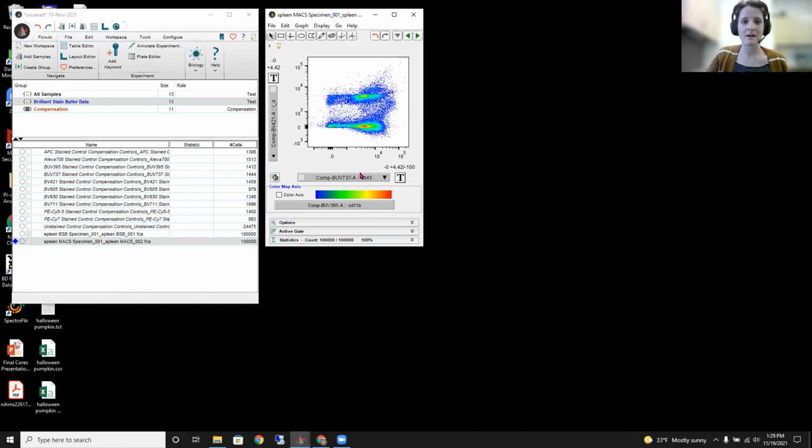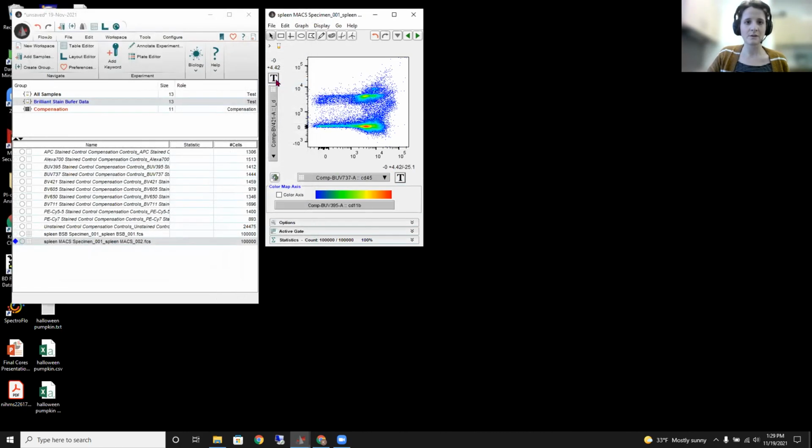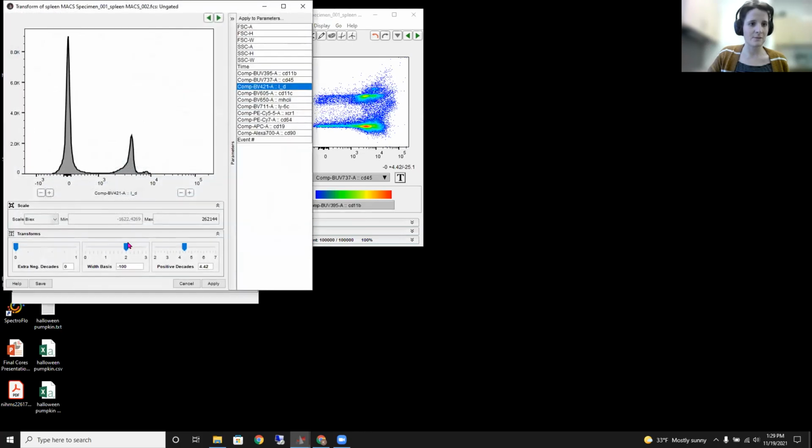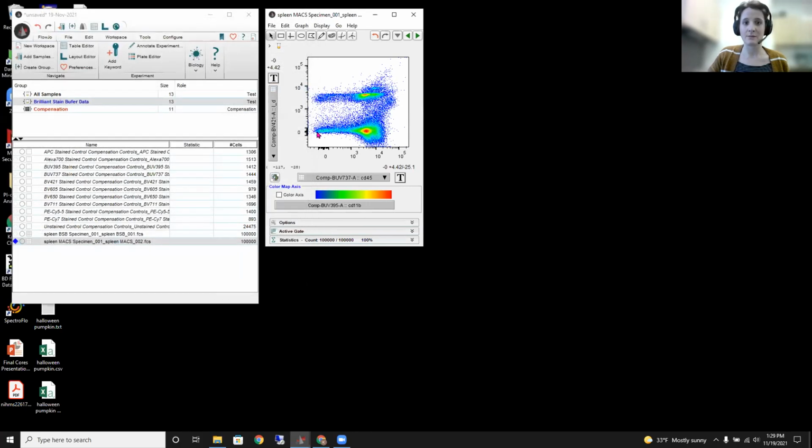So with that being said, I'm looking at CD45 versus the live/dead, and I'm going to optimize my display here through the transform button in FlowJo. So this is not only panel design, but you get some tips and tricks in FlowJo if you weren't aware of them. We could adjust that with biexponential and look at the linear-log display in a little bit better fashion to better pull out our populations.